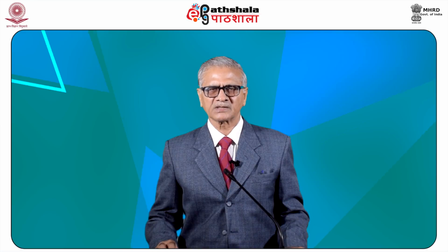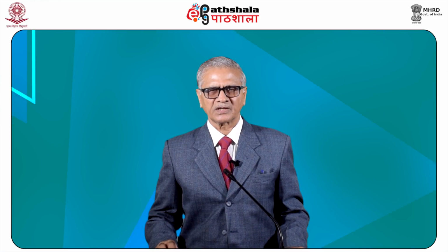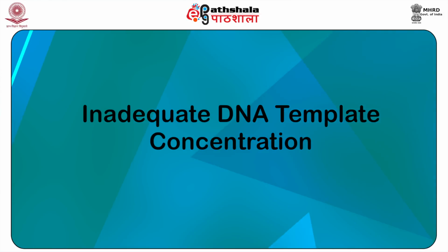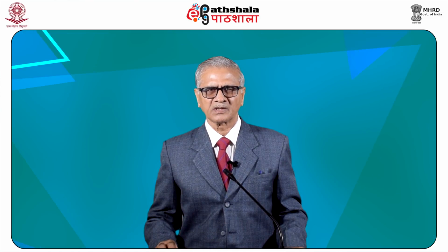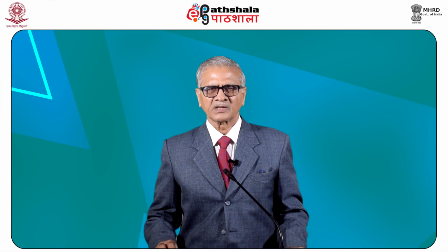Following are some of the reasons which lead to PCR failure. Number 1, inadequate DNA template concentration. A correct determination of DNA template concentration is not always possible with spectrophotometry. It rarely gives a true determination due to the presence of chromosomal protein and RNA etc. The best way to determine the DNA template concentration is by visualizing the stained DNA on agarose gel along with standards of similar size and known concentration.